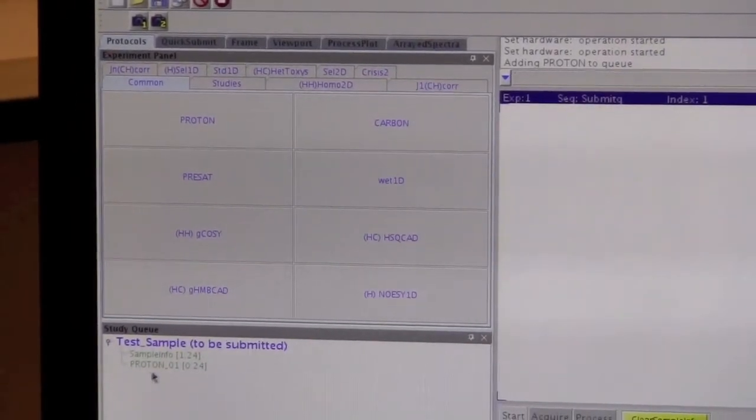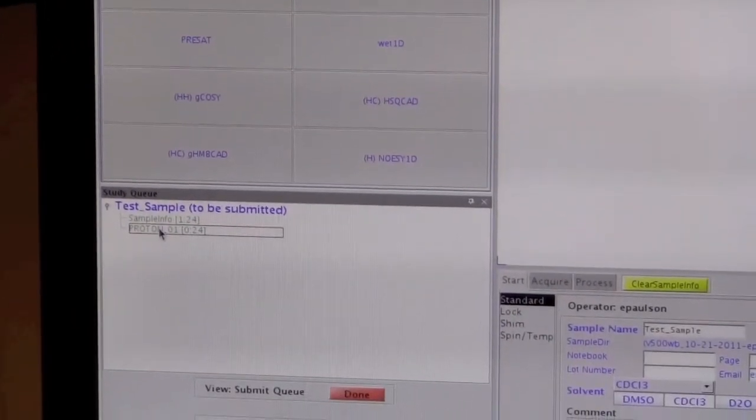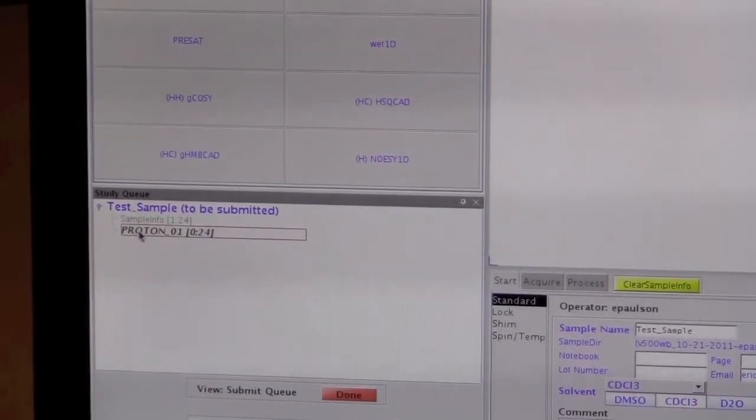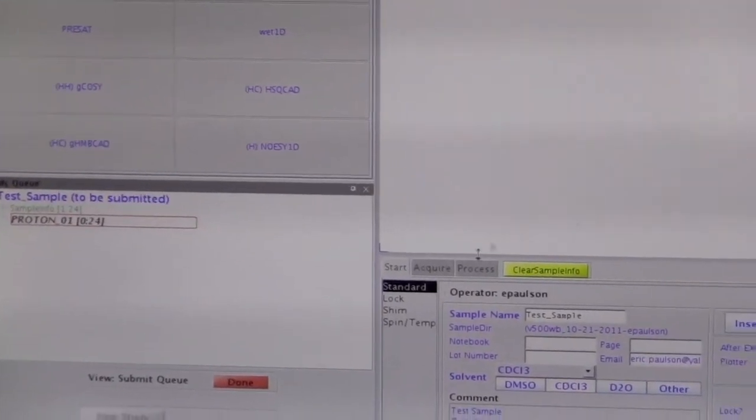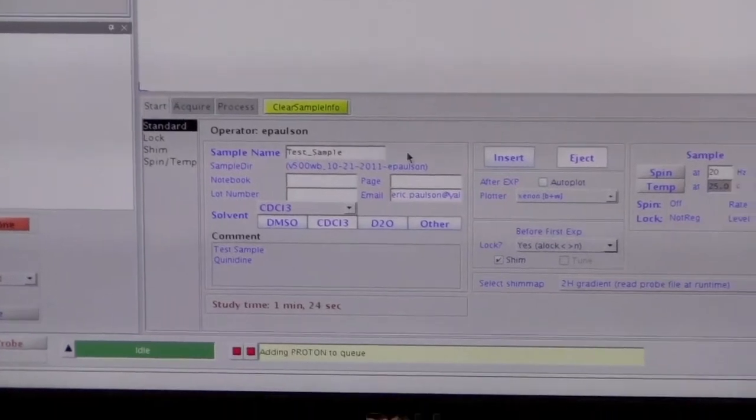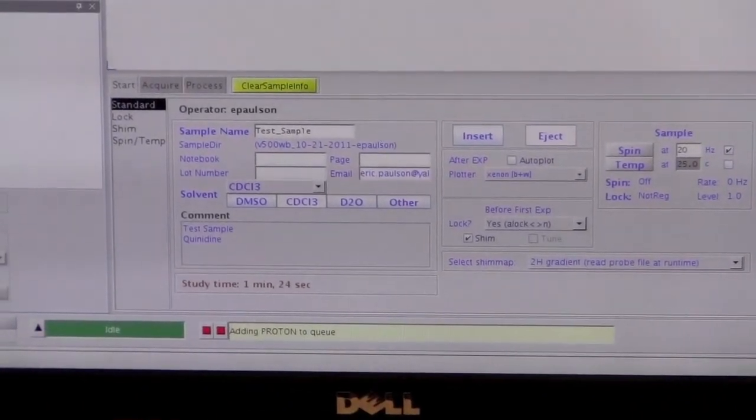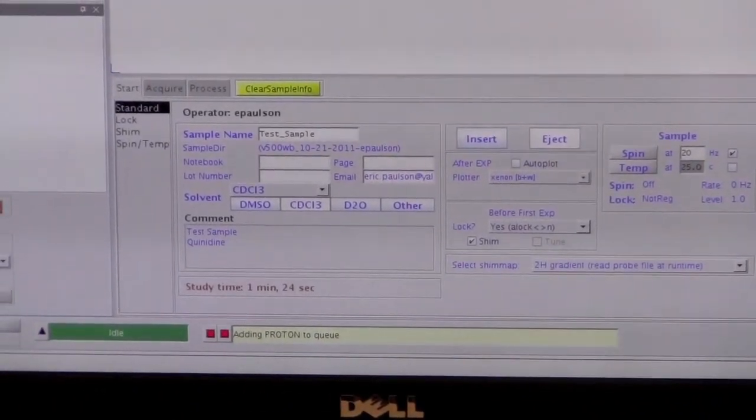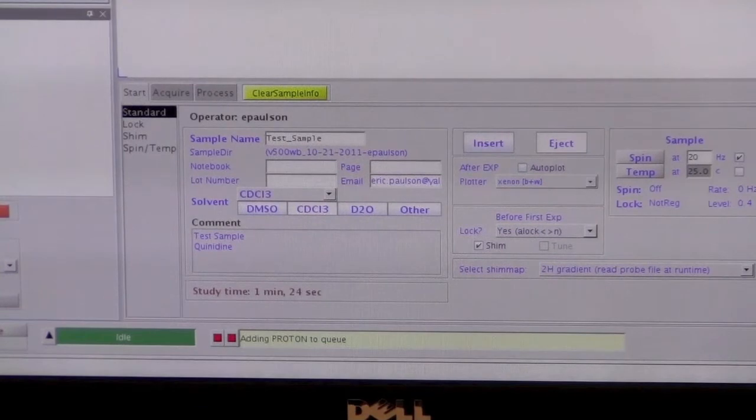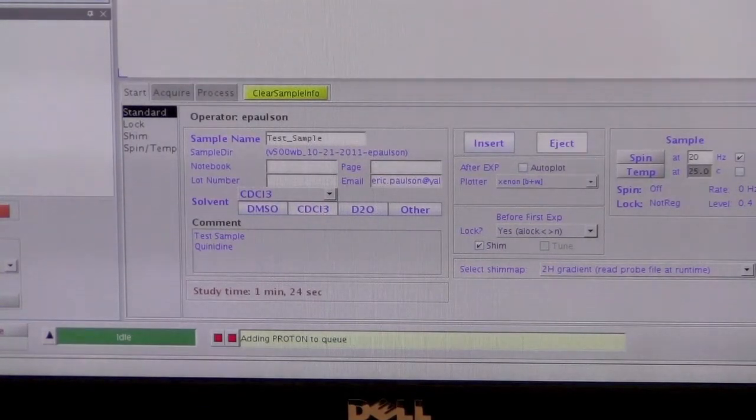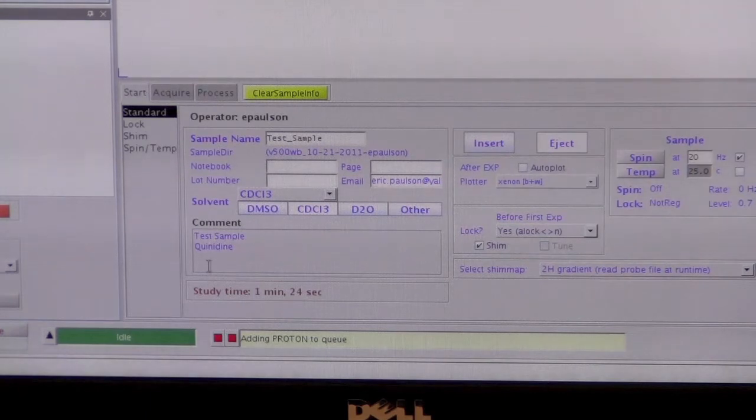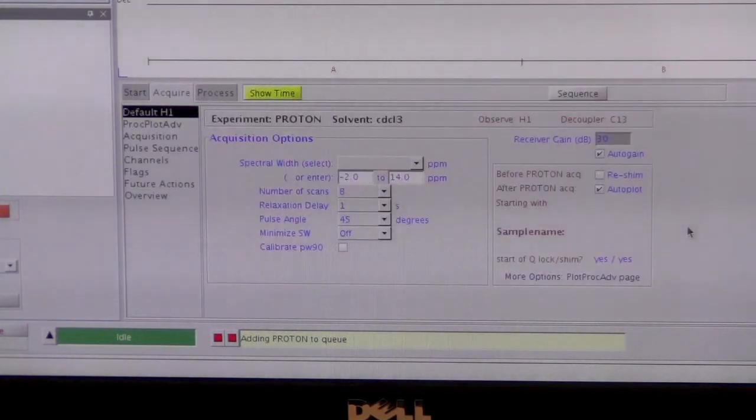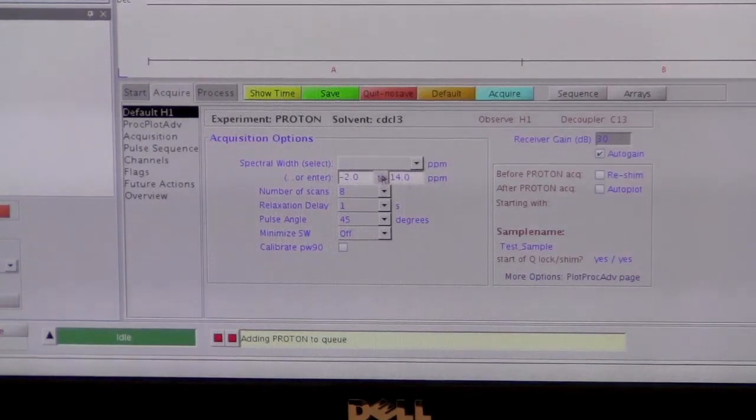If you want to customize the experiment, you can double click on it. It'll turn black. And then eventually this screen over here will show up, and you can customize whichever experiment has been colored black here. It takes a few seconds before it happens, so just be patient. It's working, but it will eventually come up, and now it's ready, and I can customize it.